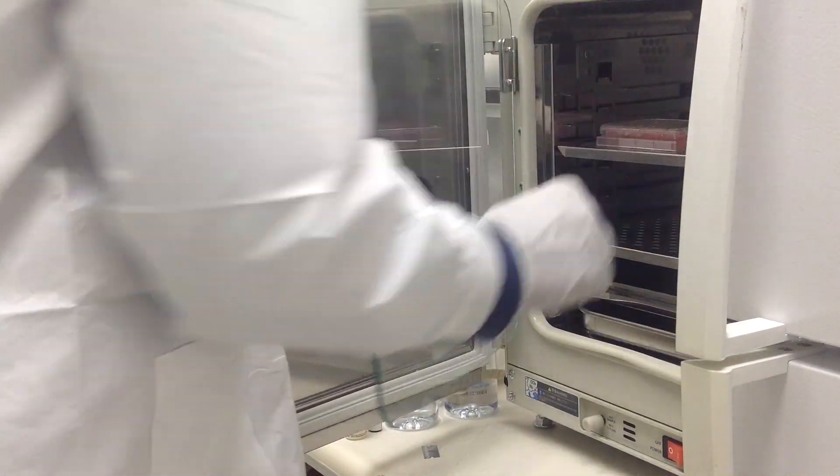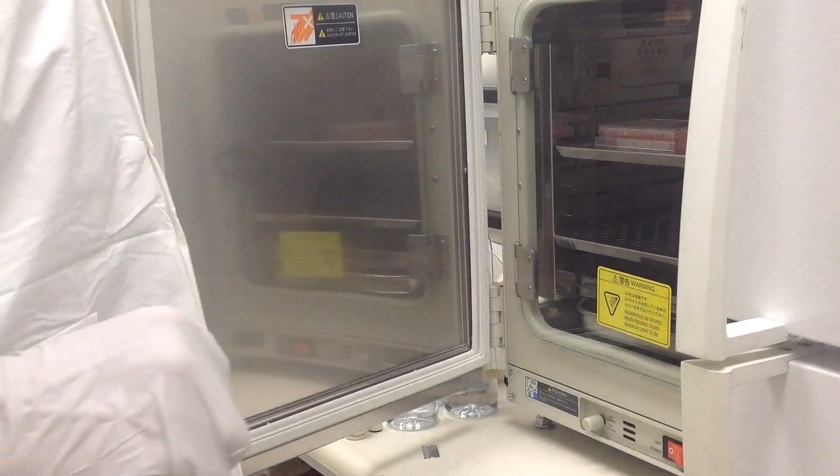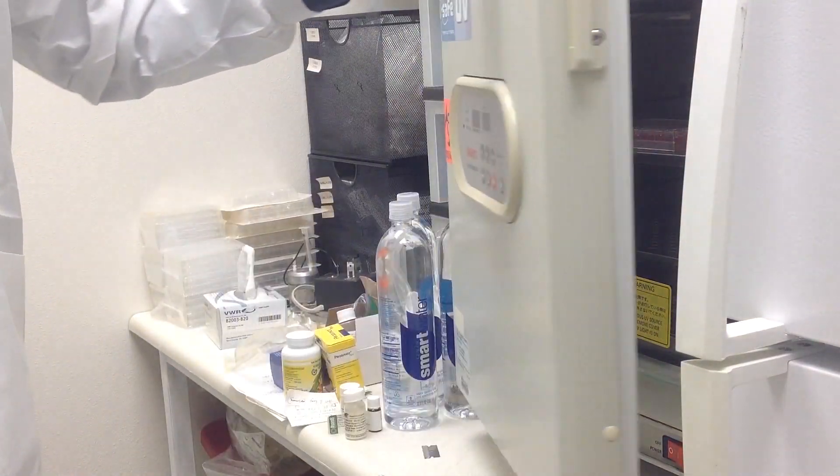Assay for phenotype or target gene expression 48 to 72 hours post-transfection.